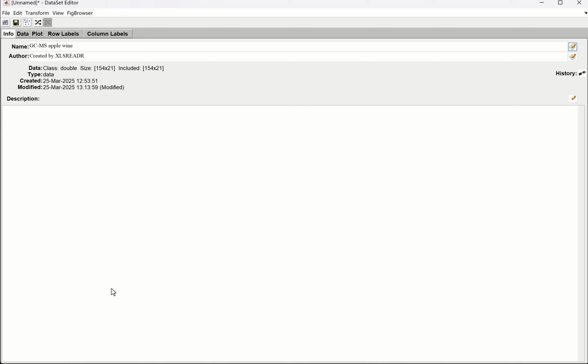And here's the peak, the interval where we find acetone. I fitted a model, and as is usual in PARADISE, several different alternative models will do the job, but this one looks nice. It's the red compound here. So let me just, for the sake of the visual appearance, remove the other ones. Oh no, it's the green one, sorry. It's this one. This is acetone. We can look it up in NIST and see if that makes sense. And indeed, we get a fairly good match. So this is acetone indeed.